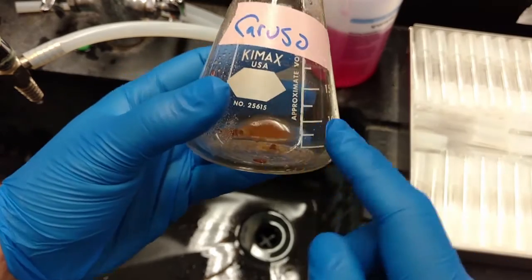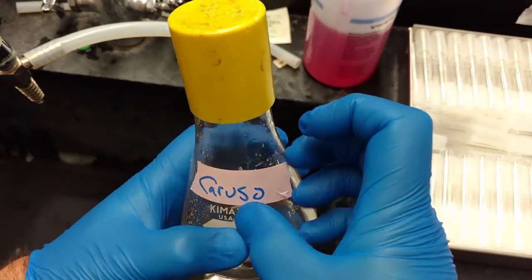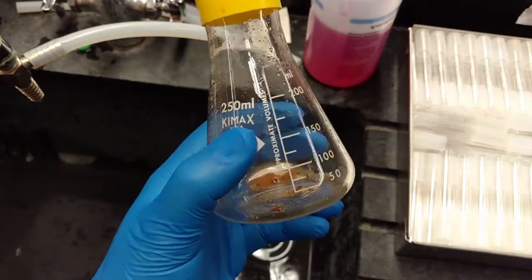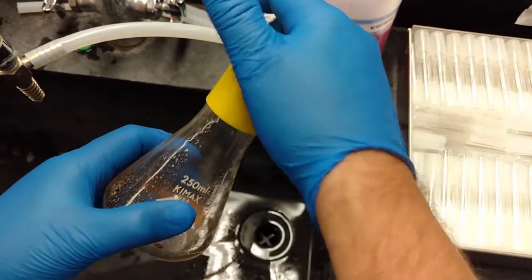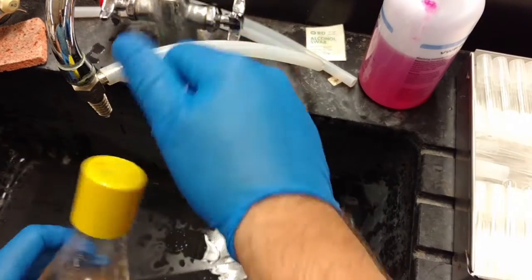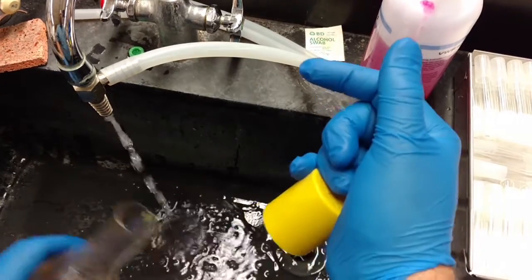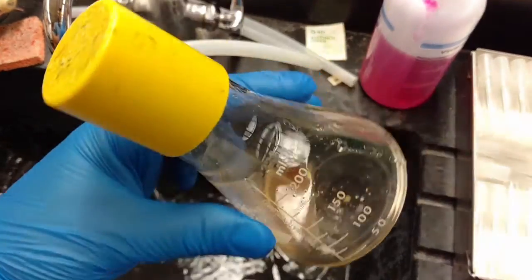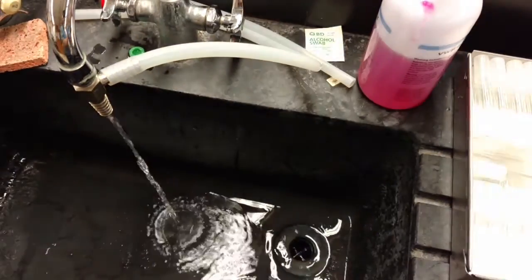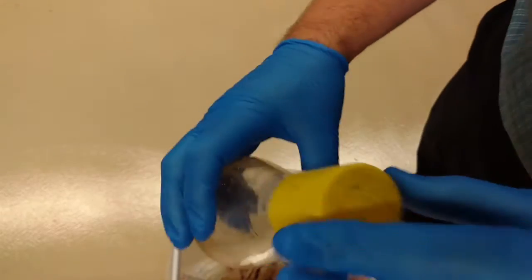While the centrifuge is spinning to pull down the soil and bacteria, we'll clean up our flasks. The sinks don't have garbage disposals so the solids can't go down the sink. Take the tape off and put just a small splash of water in the flask — not too much, because whatever goes in here is going into the autoclave bag. Use that water to get all the solids floating around, then take it to the autoclave bag and dump it in.